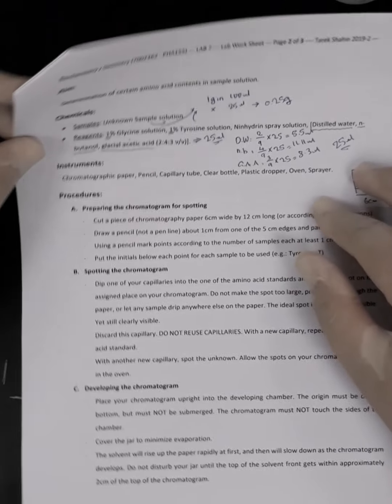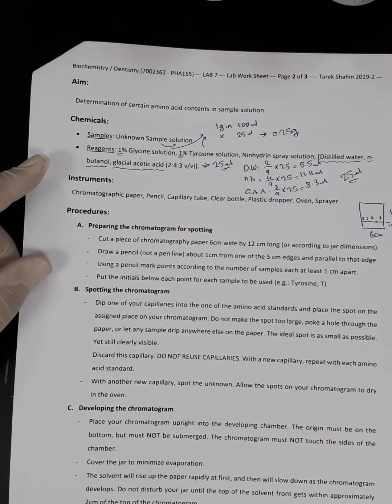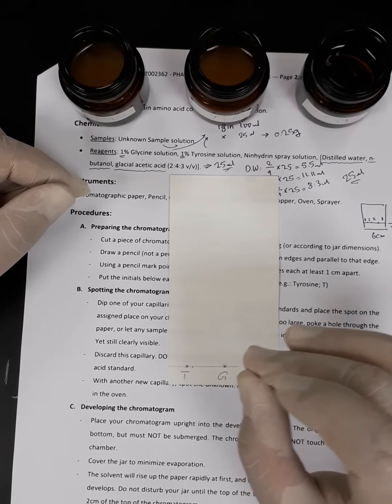Next step, we are going to apply the spots from the different samples on the chromatographic paper. So we will get our chromatographic paper and we will get the capillary tube, and then we will use the capillary tube to take from the sample and the standard solutions. So we'll do it like this. Okay, this is glycine. So I will move perpendicularly and I will spot on the glycine. So this is the first spot.